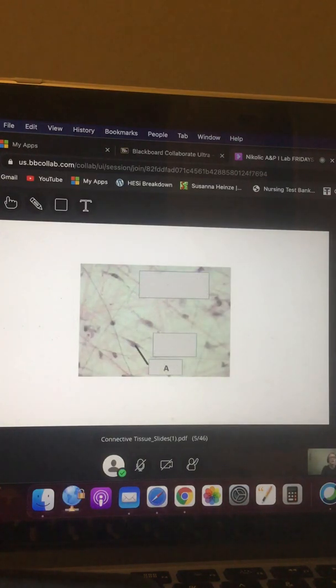All right, guys. I don't love this picture, so I'm just gonna move on. Just because they're collagen fiber. Well, this is good. A. What's A? I like A. I'm good with A. Ready? It's janky.